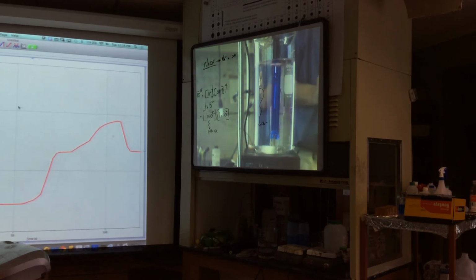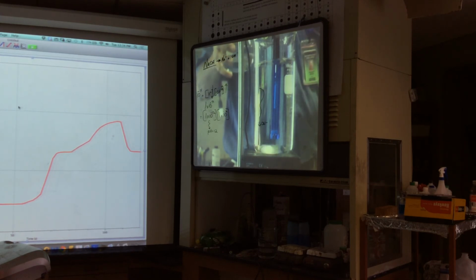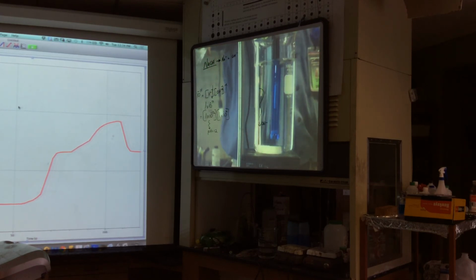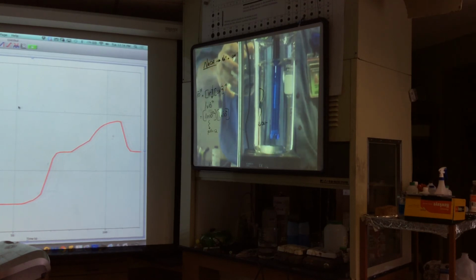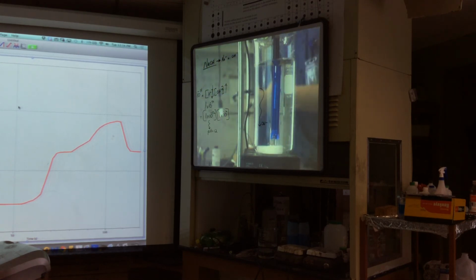Cool part is, why did it disappear? This is the really cool part. The reason why it disappears is the extra hydroxides I add are being tacked by the H pluses. It's called neutralization. What do you think H plus and a hydroxide, OH minus, make? They make water. And the pH of water is 7. Okay? So that's the demonstration.